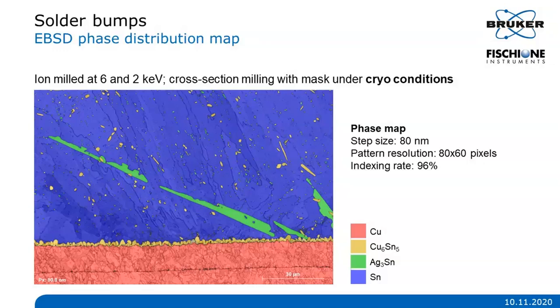So yes, we test anyway when we do 3D. You could use the focused ion beam milling to prepare the area for EBSD. Of course, it's possible. If I can add something to that question: of course, using the FIB, you will get a very restricted area. Even for plasma FIB, it's a little bit restricted. Even for plasma FIB, you will not get more than 100 microns width area, which is very small.